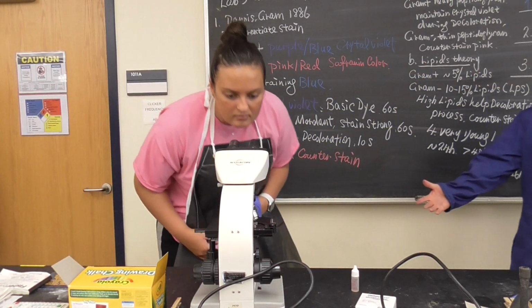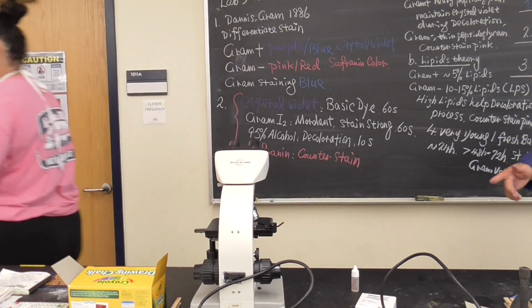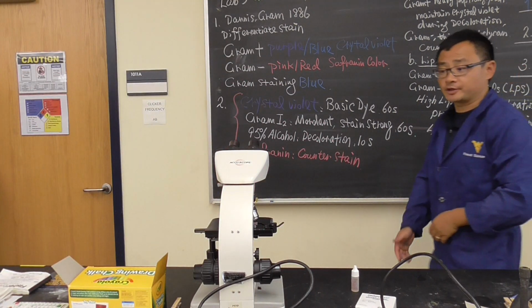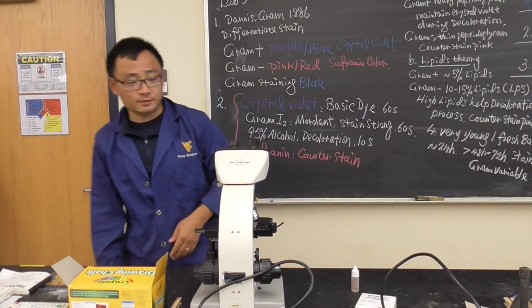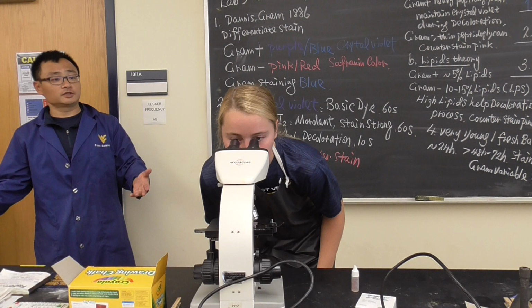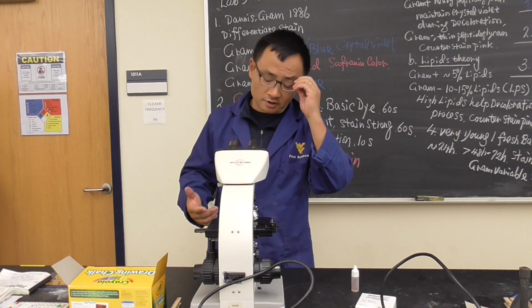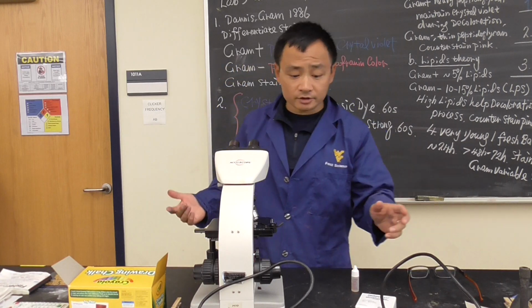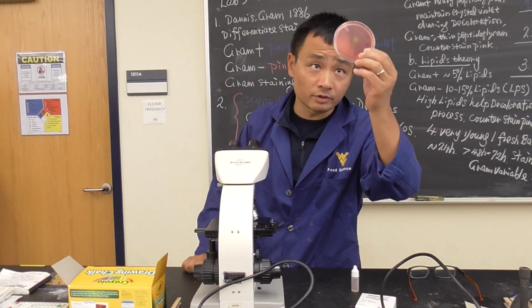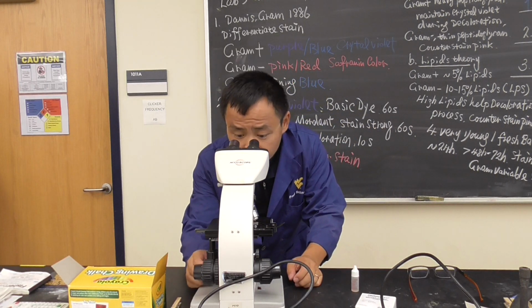See, I did only about maybe 15 seconds. The time doesn't matter. Come here to see it. I think it's a very good picture. It's better than lots of the textbook pictures. The cocci are seen, and you see the grape shape. Okay? So that's the Staphylococcus aureus, and I need to tell my students this one we may need to be restrict. Ideally, it's good.